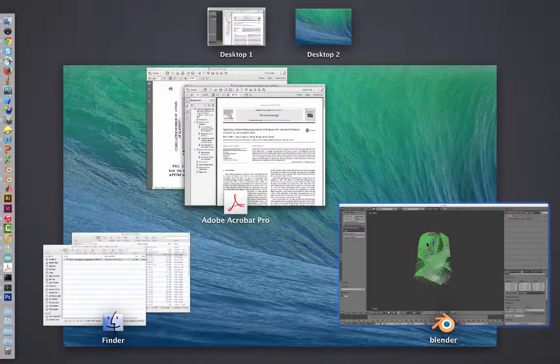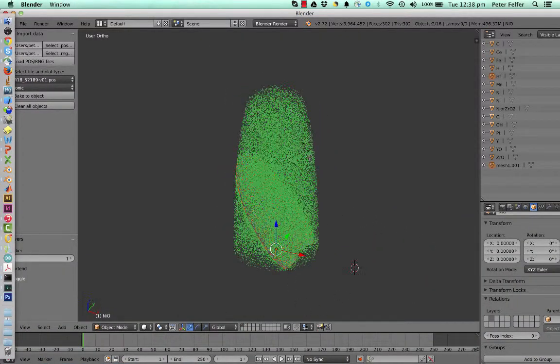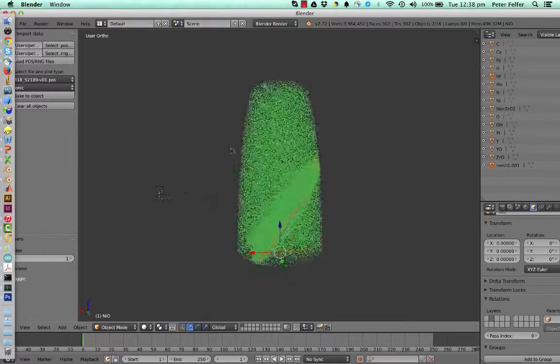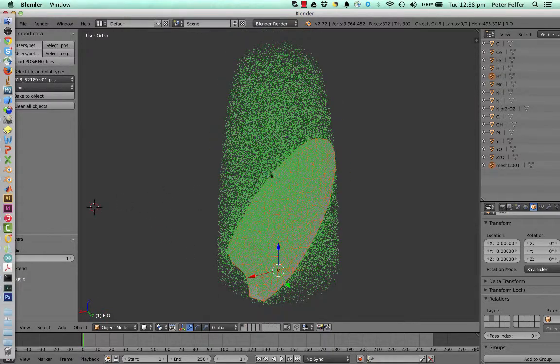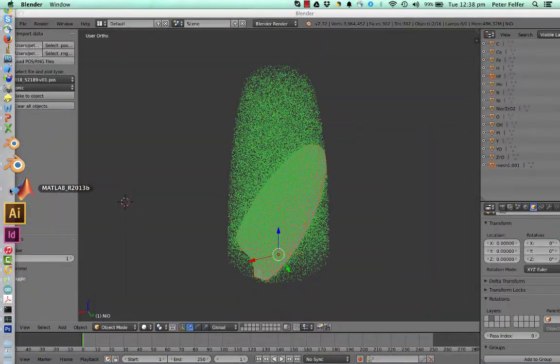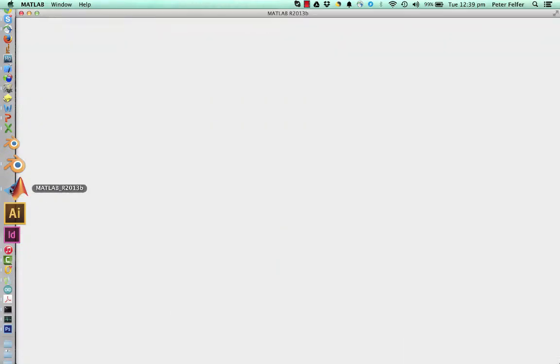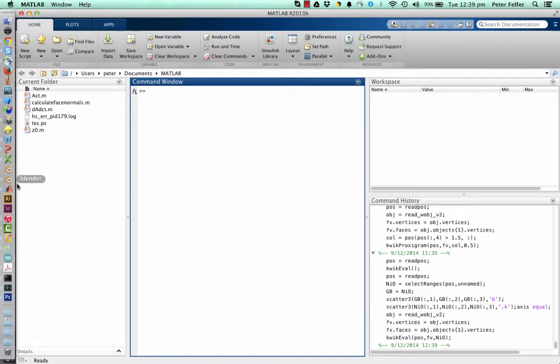So let's get cracking with the MATLAB part. So once again, we're going to do the analysis in MATLAB. We'll start with the grain boundary here that we've calculated the proximity histogram for earlier. And we'll just go and load the data in. So what we need, of course, is we need the POS file. So we need the parent POS file to get the cumulative number of all atoms.